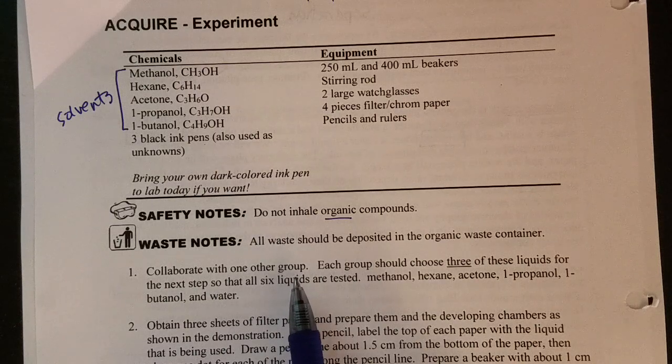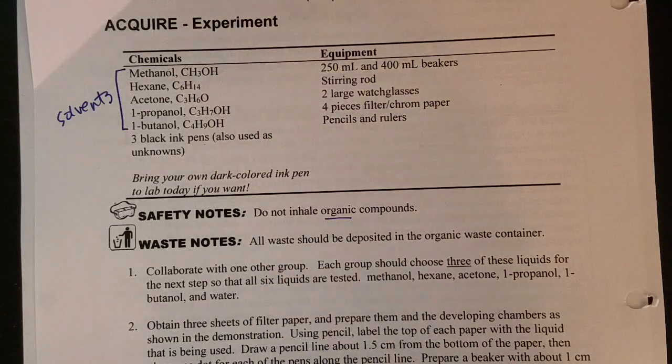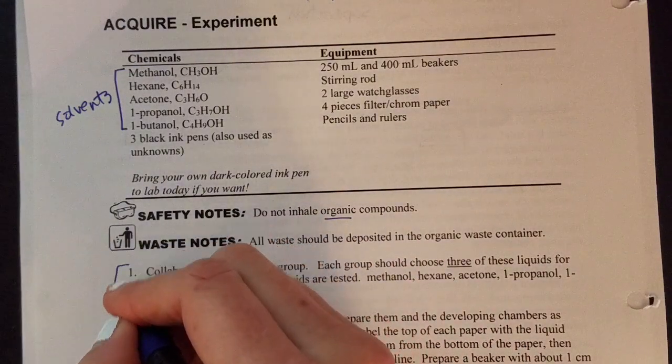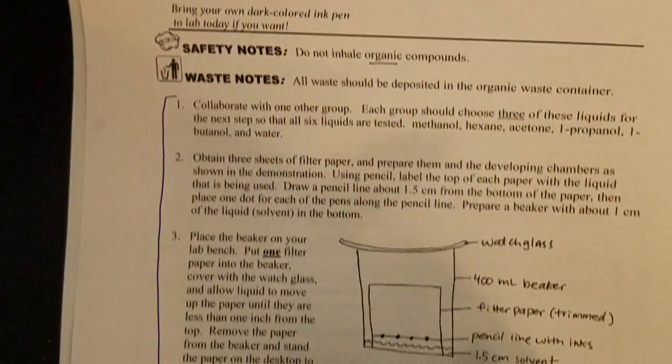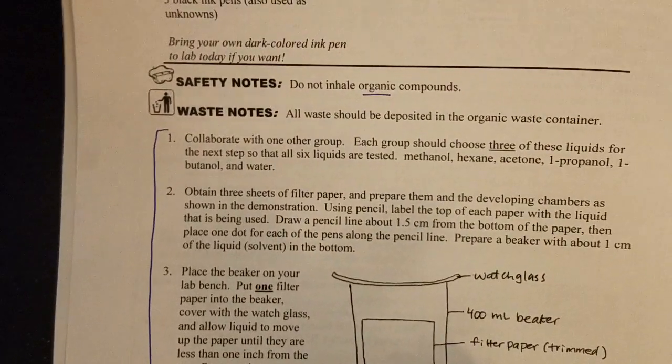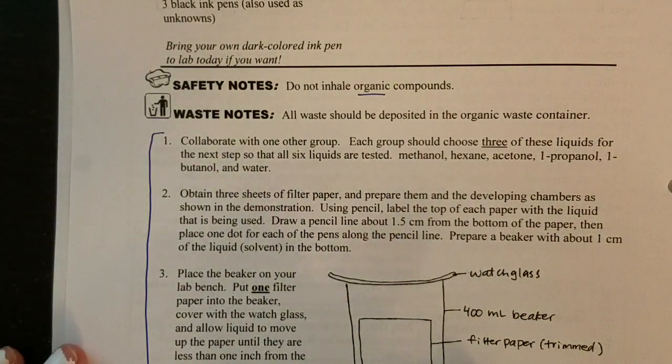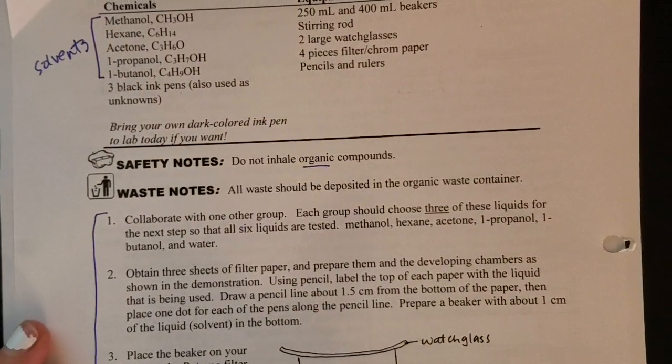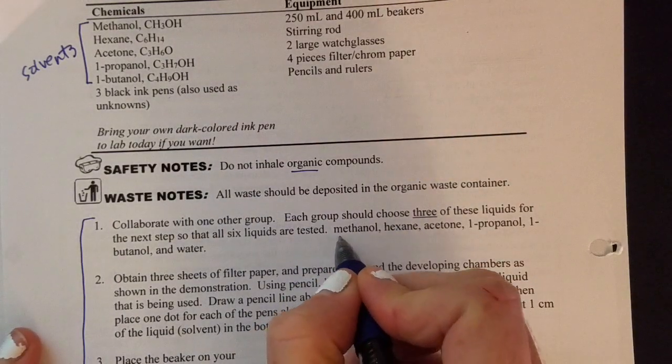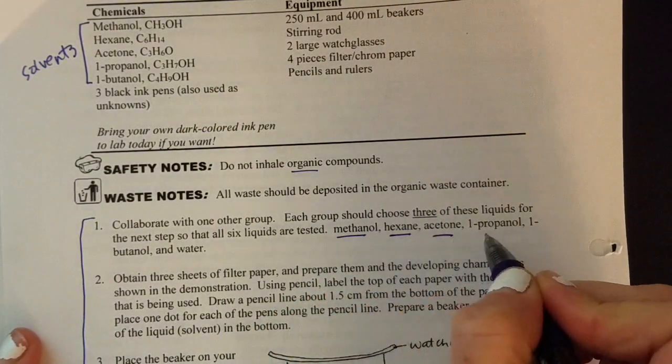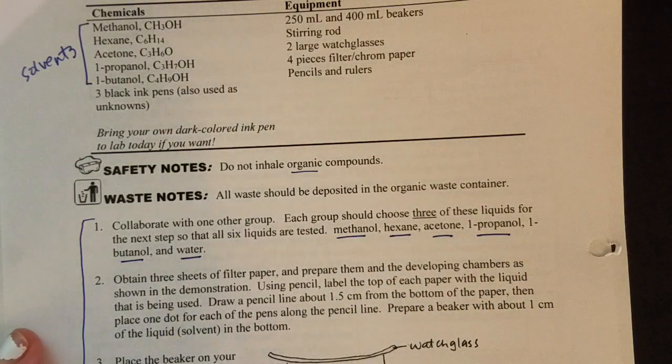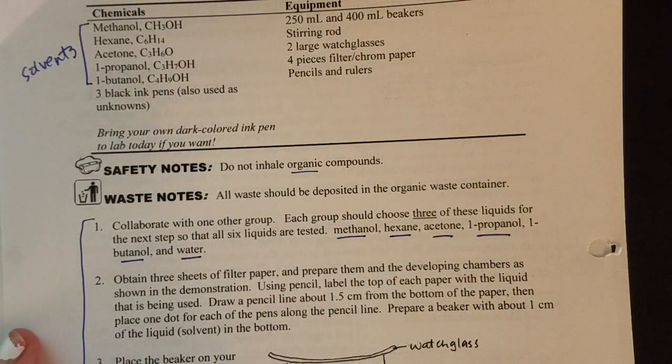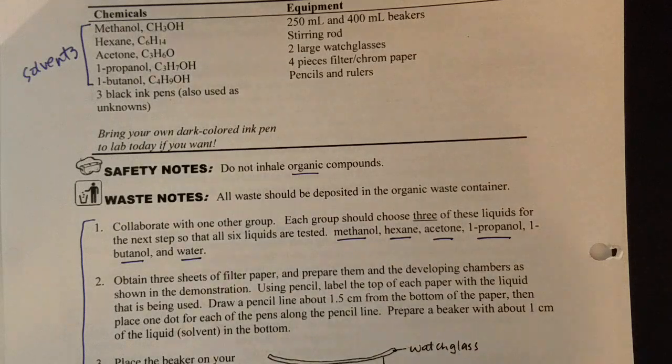So you will see in the video that you're not going to collaborate, but you will watch first. These first four steps will all be done at once for you. So you'll see six different beakers with six different solvents. And the six solvents that you will see tested will be methanol, hexane, acetone, propanol, butanol, and water. Pay close attention to what order those are in in the video. And then you'll be looking at results from that.